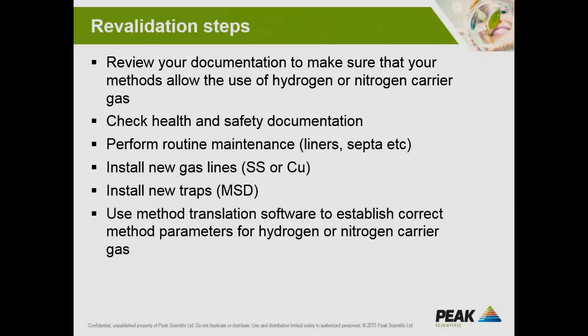So it will reconfigure the method for you. Also reconfiguring any oven ramp rates and oven holds that you have on your GC method. So it's definitely a good place to start. If you have any more questions regarding this, feel free to email me and I can provide you with information.